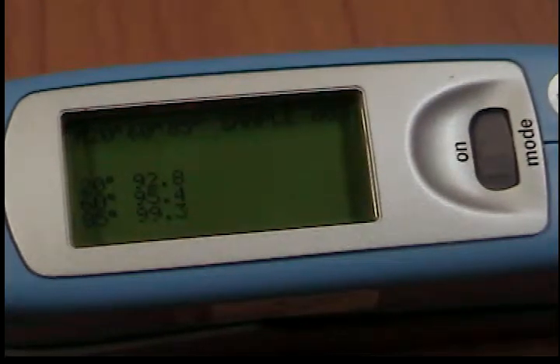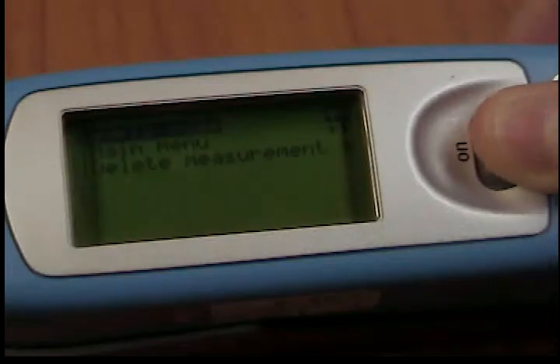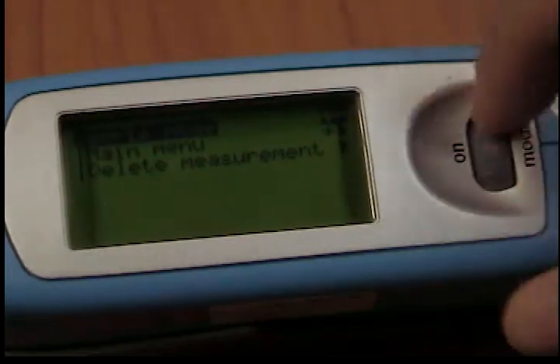If you would like to delete the last measurement, please scroll the wheel and select the appropriate menu item.